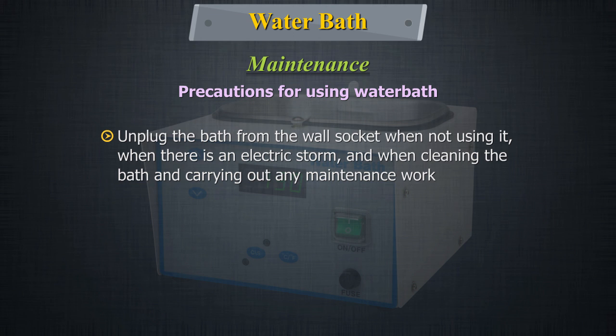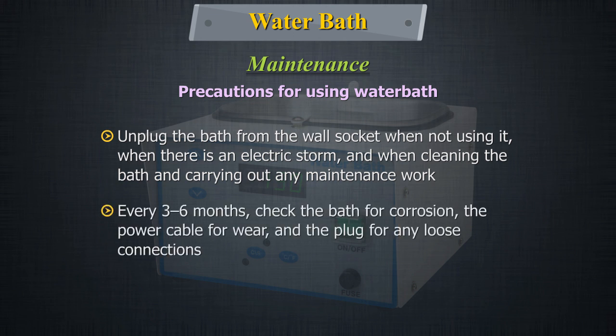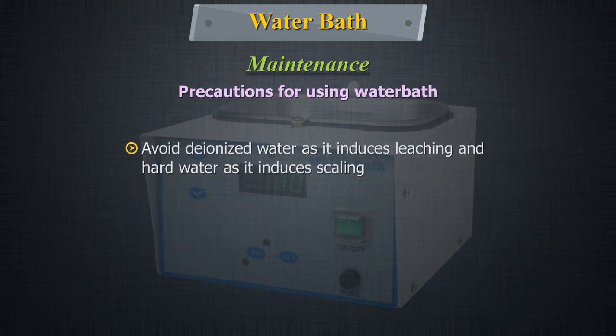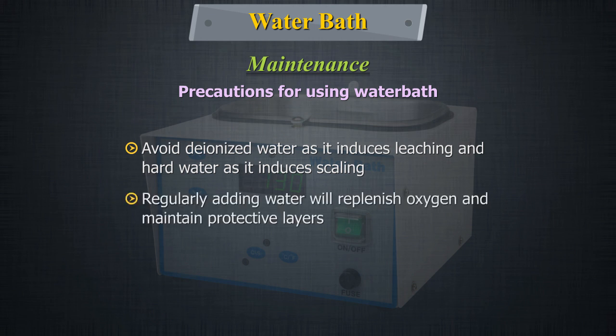Unplug the bath from the wall socket when not using it, when there is an electrical storm, and when cleaning the water bath and carrying out any maintenance work. Every 3–6 months, check the bath for corrosion, the power cable for wear and the plug for any loose connection. Avoid deionized water as it induces leaching and hard water as it induces scaling. Regularly adding water will replenish oxygen and maintain protective layers.